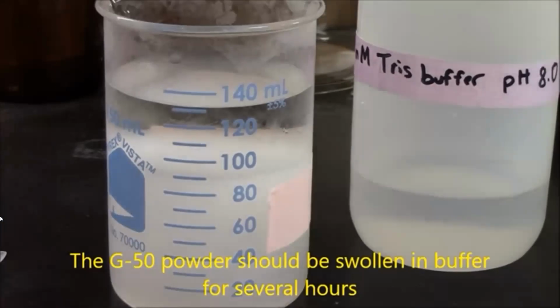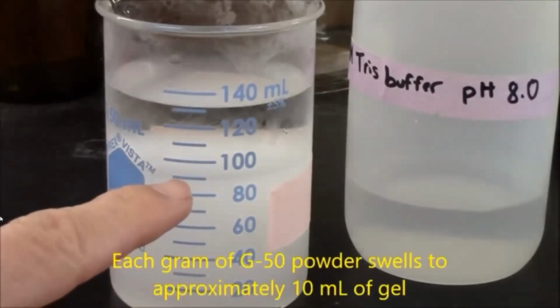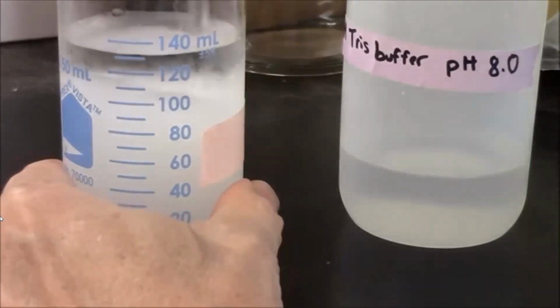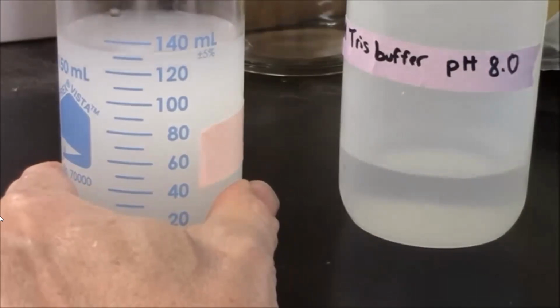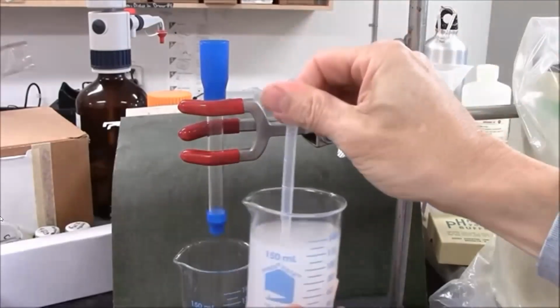Powder overnight using this Tris buffer, 30 millimolar Tris buffer, pH 8.0. You can see that the 9 grams has swollen up to a volume of about 90 milliliters, almost 10 milliliters per gram of solid. Now I'm going to gently stir the gel. It's important not to stir this too vigorously. Don't mechanically stir this. That can break your gel particles up into very fine dust, which will impede your flow rate in the column. This is making a slurry. I'm using a sawed-off pipette to transfer my slurry to the column.